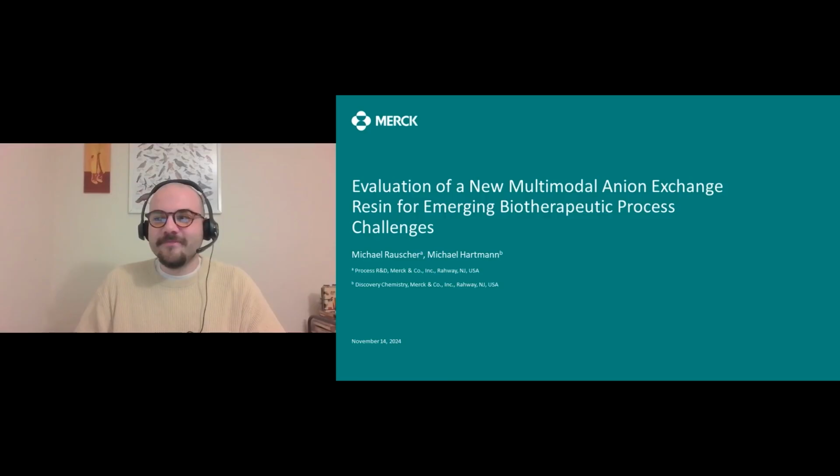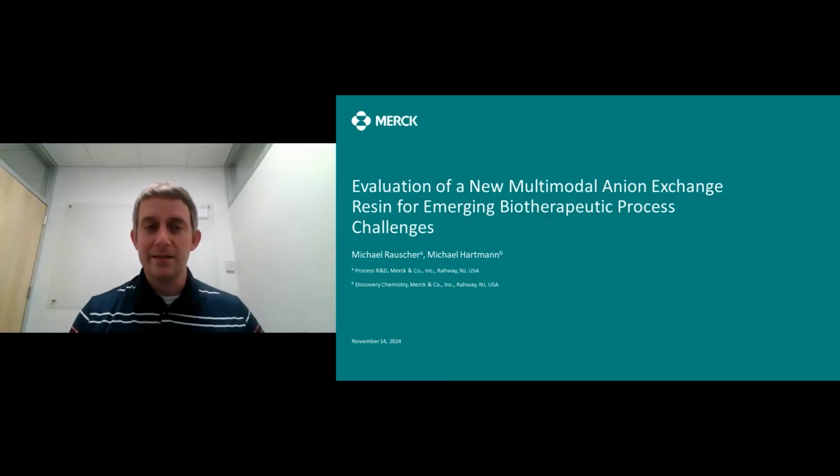Thank you, Alex, for the introduction. I'm excited to speak about some of the work that we've done today. So we'll be focusing on evaluation of a new multimodal anion exchange resin for an assortment of different biotherapeutic process challenges.